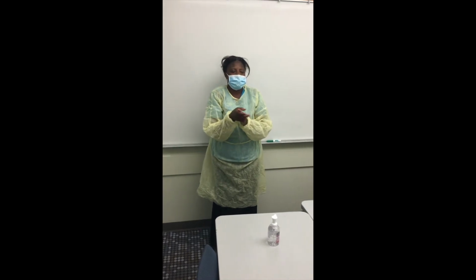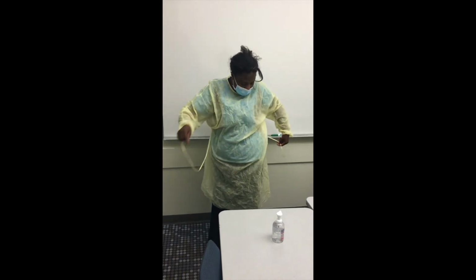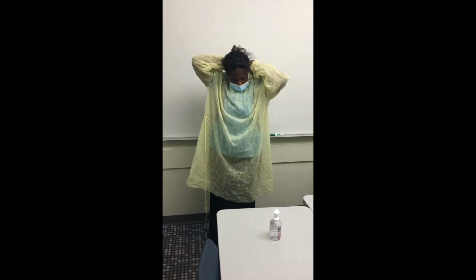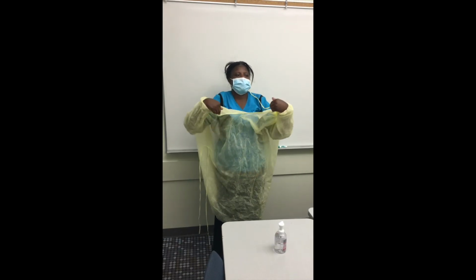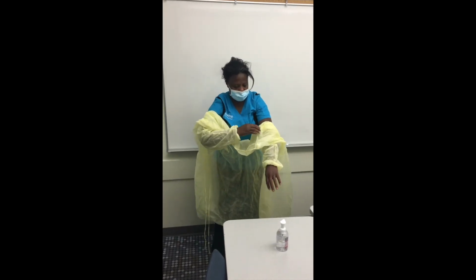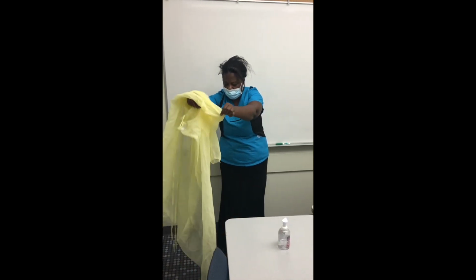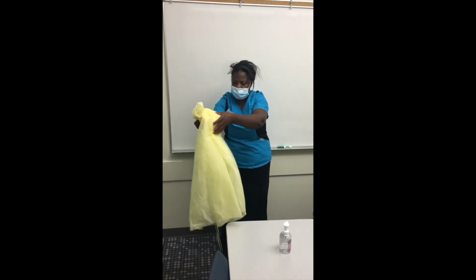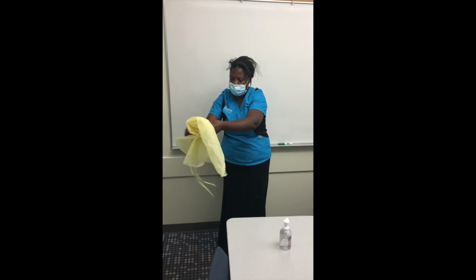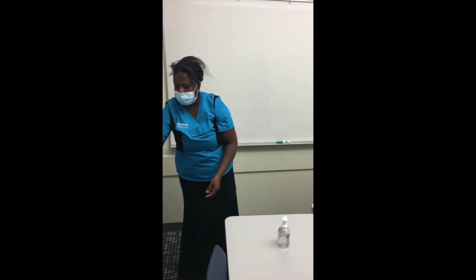Then remove the gown. Starting from the waist, untie, and then untie around the neck. Make sure not to touch the outside contaminated part of the gown, and roll the gown away from you. Make sure it does not touch your body. Discard the gown into the appropriate receptacle. Perform hand hygiene.